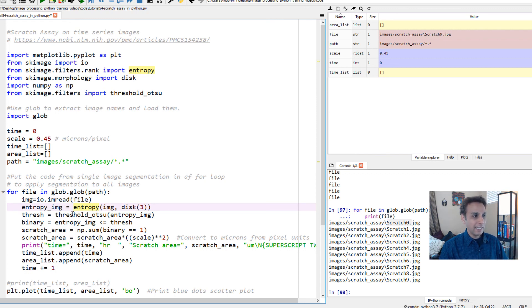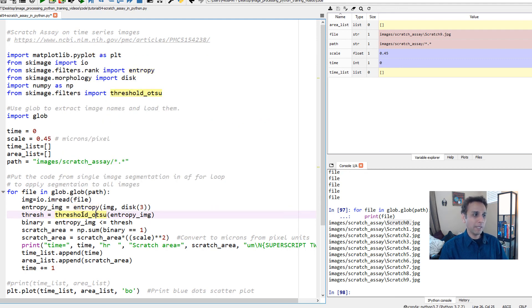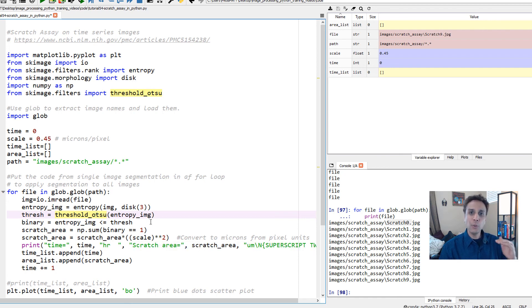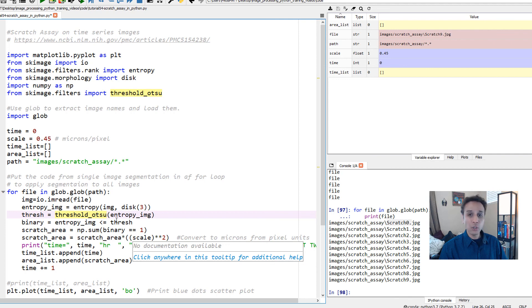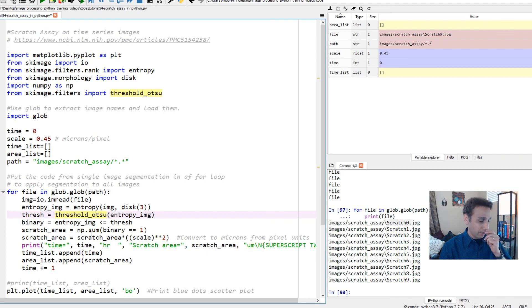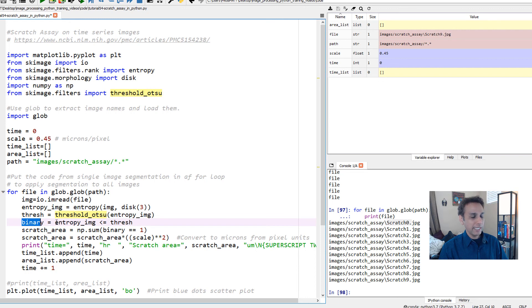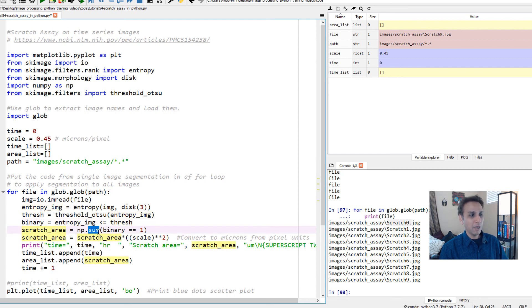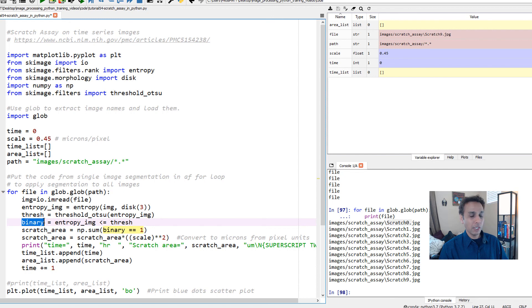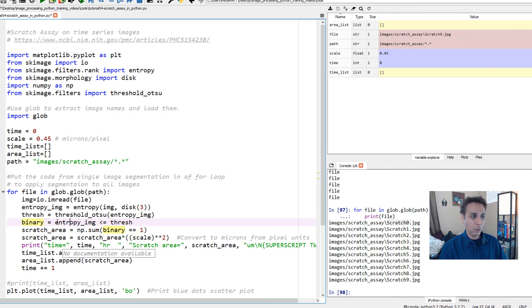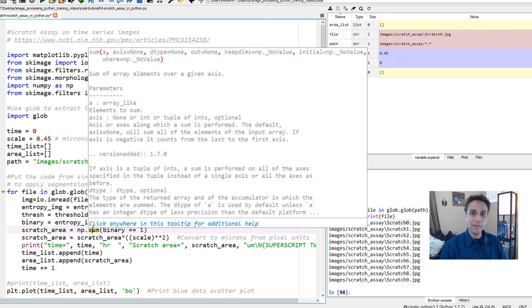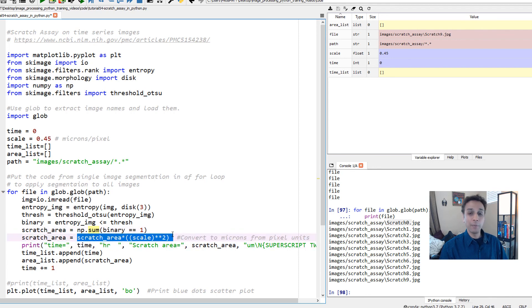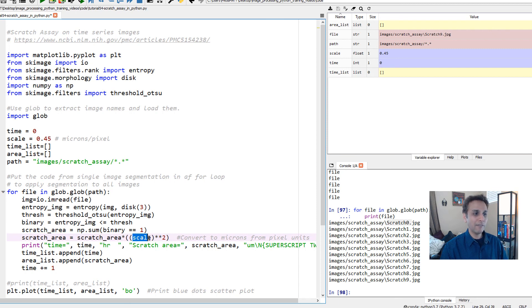Once the image is loaded it's going to calculate the entropy just like we talked in our previous tutorial, apply the threshold, and create a binary image. All of these are lines that we have used in the previous tutorial when we were trying to understand how to quantify disorder or texture. The scratch area is the sum of all the pixels where the value of binary equals one. All the values that are true or one are the ones with low texture or low entropy. We're summing up all of that.